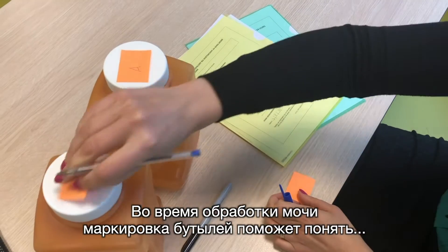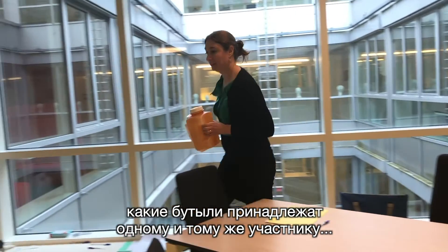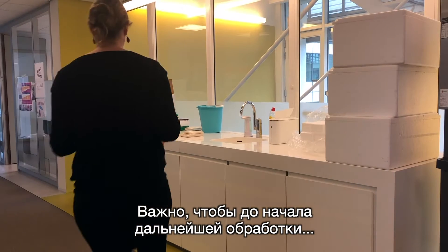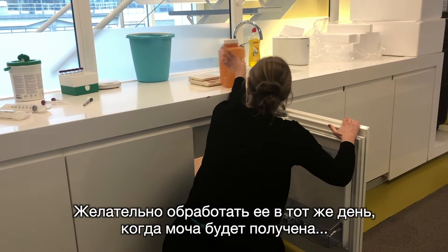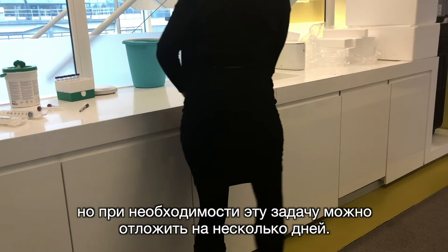Marking the bottles makes it easier to see which bottles belong together while processing the urine and whether a participant has handed in one or more bottles. It's important to store the urine in a cool place until it is further processed. This processing must take place preferably on the same day that the urine is returned, but can wait for a few days if needed.